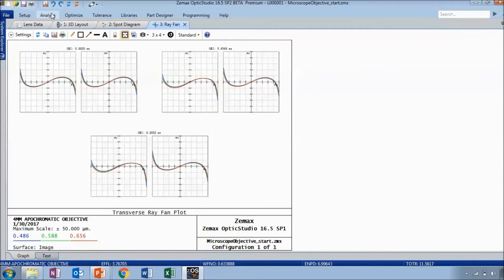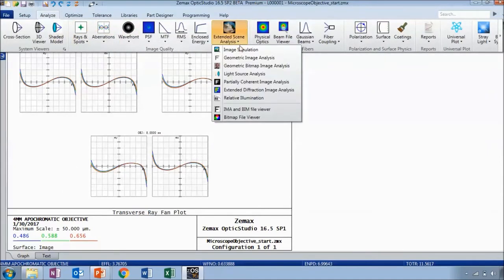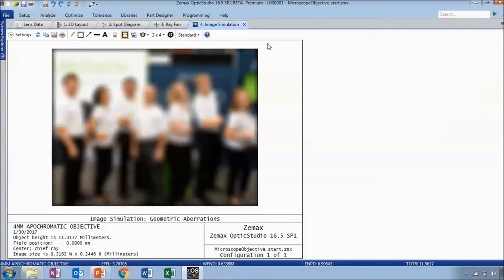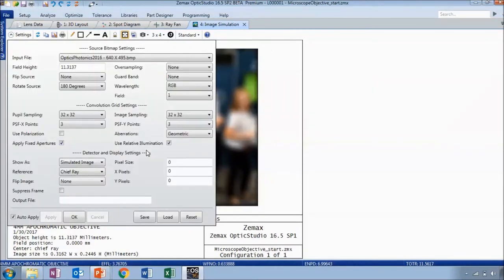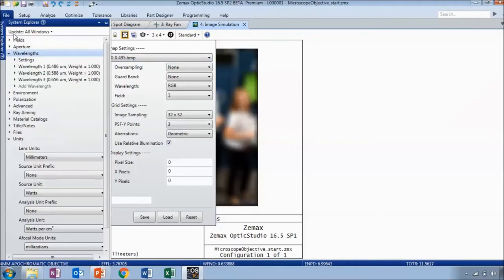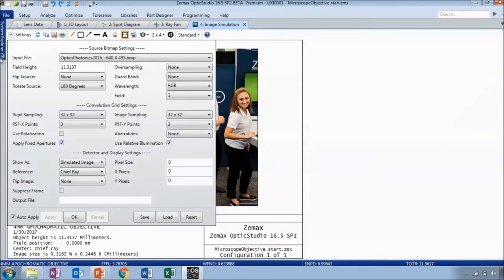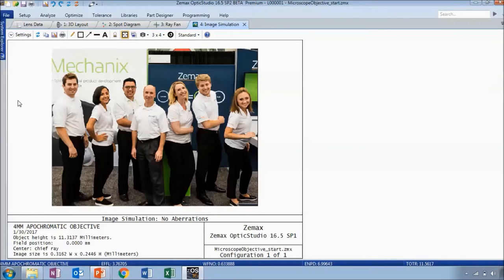Let's look at more of a full-field analysis. Under extended scene analysis, let's open up image simulation. This is using settings I had defined previously with a photo I selected. Right now we're looking at the geometric aberrations as well as distortion. If you want to see the effect of distortion compared to the geometric aberrations, we can set the aberration setting to none, and the image looks pretty crisp — which indicates that the dominant aberration is spherical and distortion has little contribution.